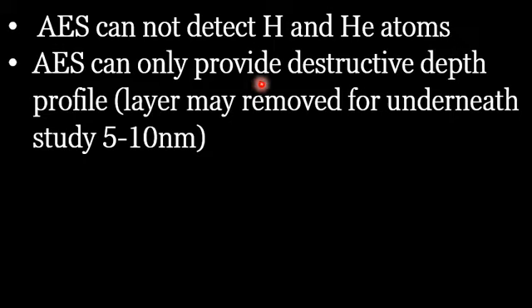If you want to analyze a depth profile of a sample, the chemical composition and elemental analysis below the deposited layer or at the interface of the thin film and a substrate, it is quite difficult without sputtering the surface of the material.